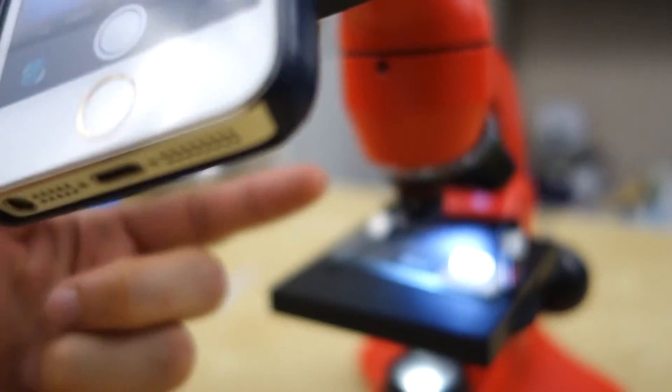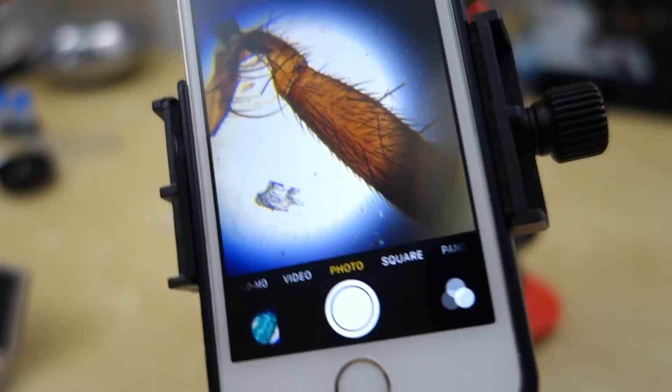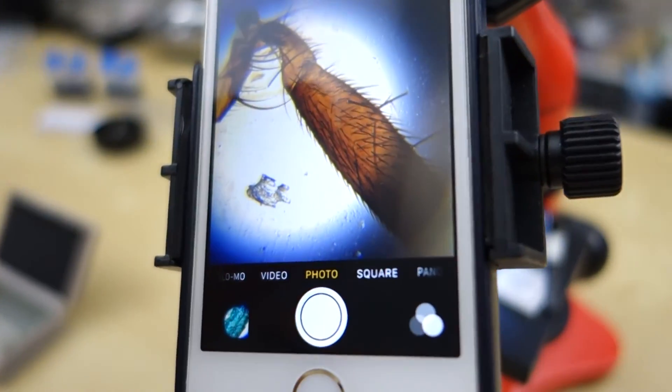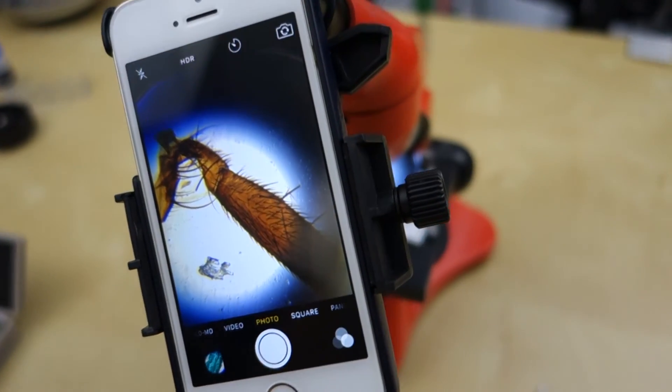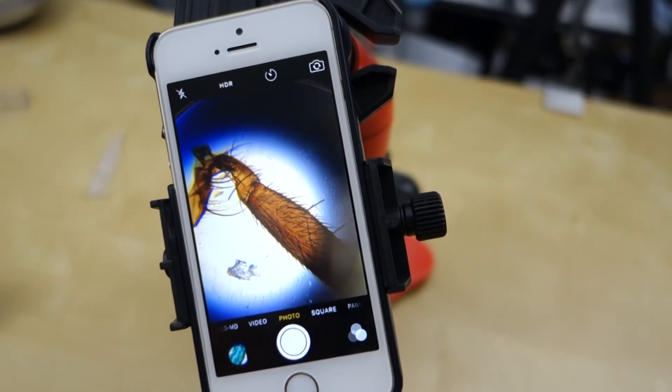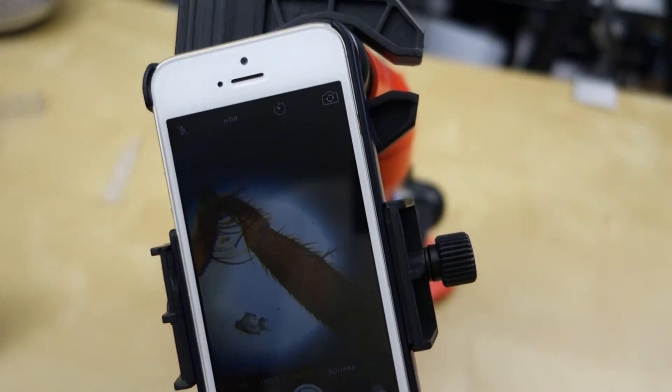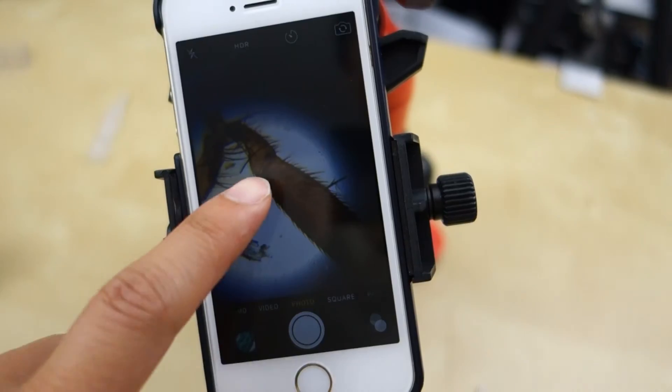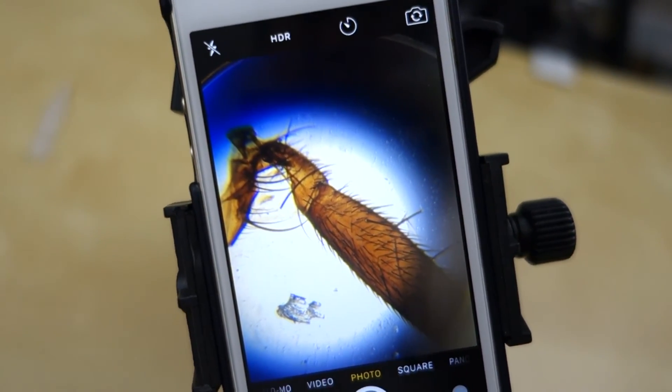So I'm saying 4X here. But actually through the different magnification, it comes up to a lot more than that. I think this is probably at about 300X or something like that. You can go from 64X all the way to 1280X. So that's the kind of different zoom level you can have. So it's not bad at all. I noticed that the scientific microscope that I used before in school went up all the way to 3000. So that kind of gives you an idea. But yeah, it's pretty cool. You can see this is kind of the result you can get. That's only 4X.